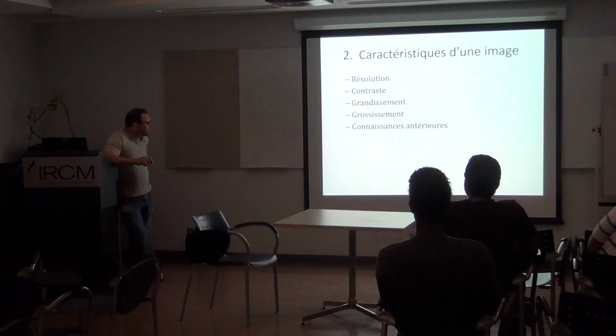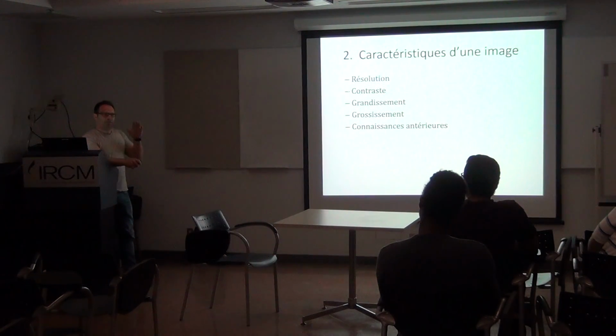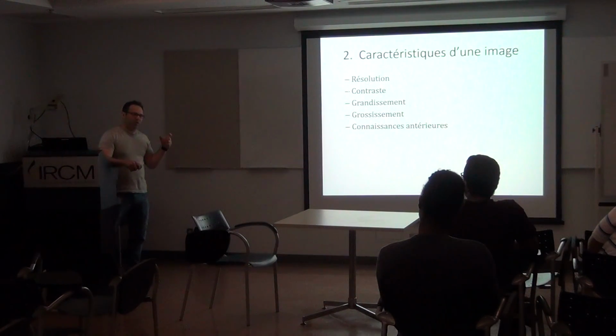Here I say grandissement and grossissement, which are a little bit different, and it's mainly about definition. But it's also a good thing to understand, and maybe to distinguish from photography.